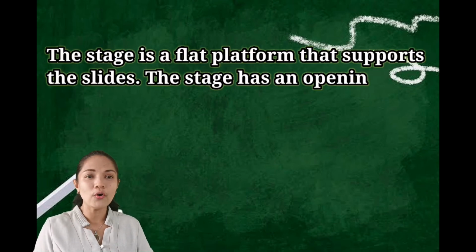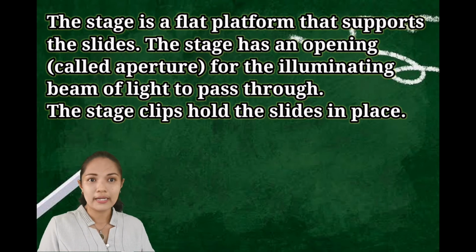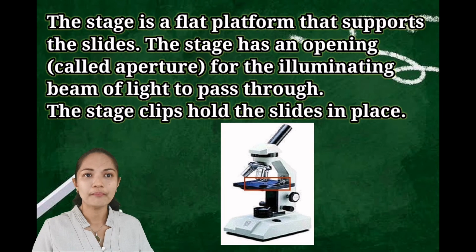Specimen stage, or the stage. The stage is a platform that supports the slide. The stage has an opening called the aperture for the illuminating beam of light to pass through. The stage clip holds the slides in place.